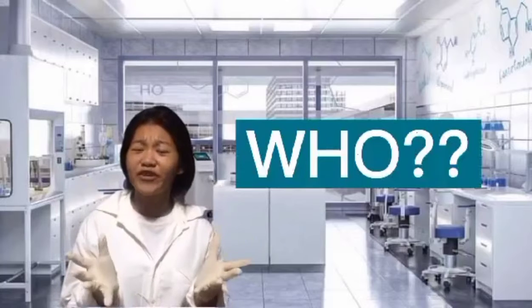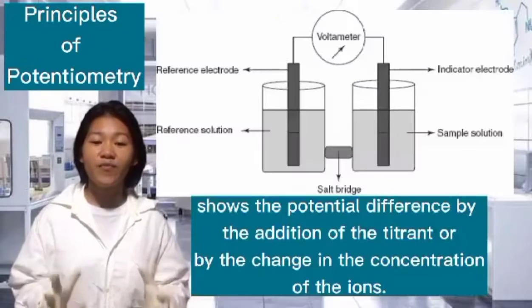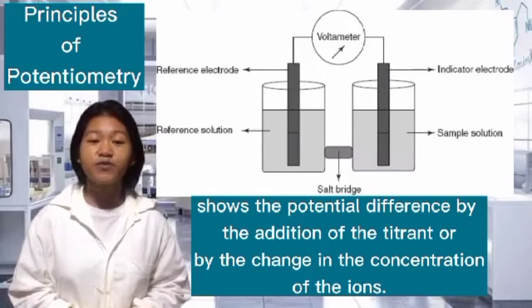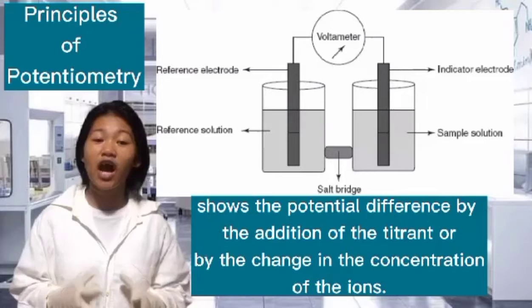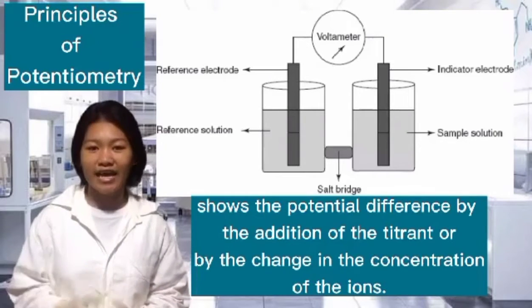So who discovered potentiometry? Well, it is Fritz Haber in 1901 who discovered that there is a change in potential across a glass membrane when its two sides are in solutions of different acidity. The principle of potentiometry is that when the pair of electrodes are placed in the sample solution, it shows the potential difference by the addition of the titrant or by the change in the concentration of the ions.